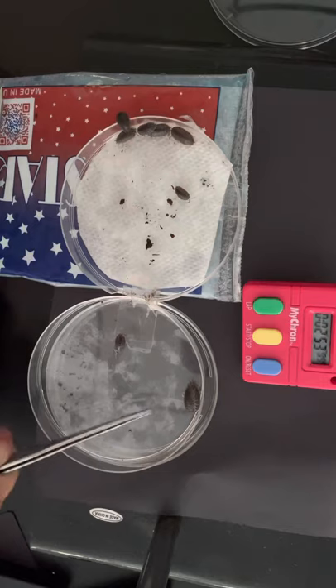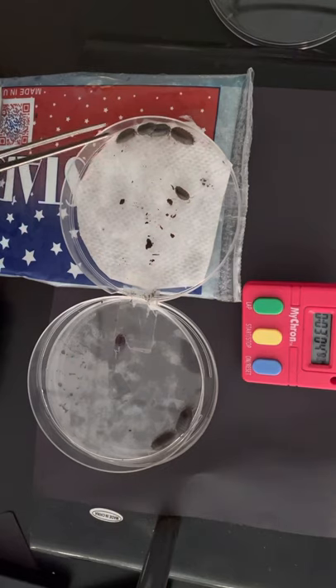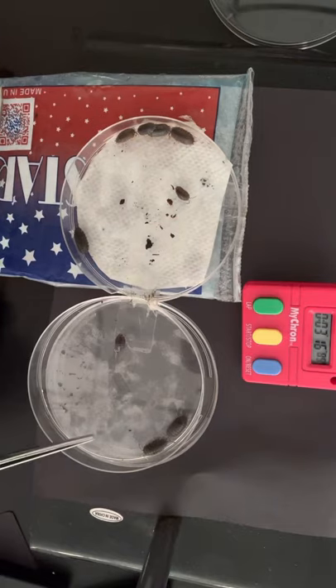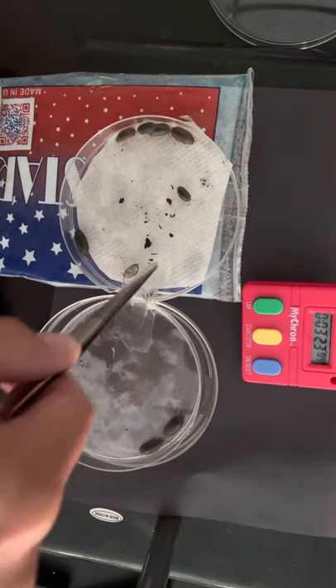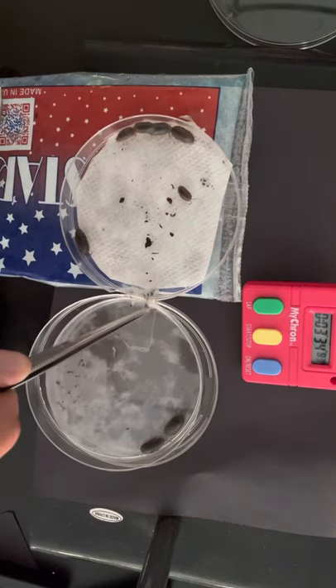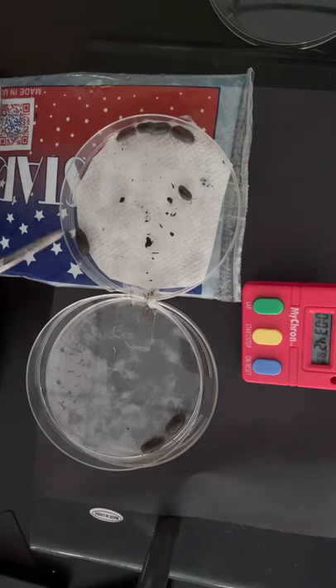They're on top of one another. One escaped again — putting him back on the cooler side. Not trying to sway the results, just trying to flip one back over.